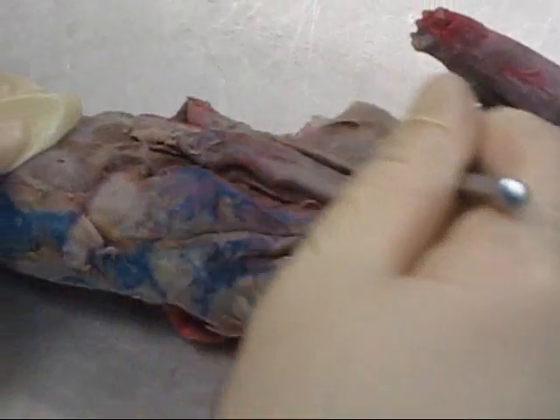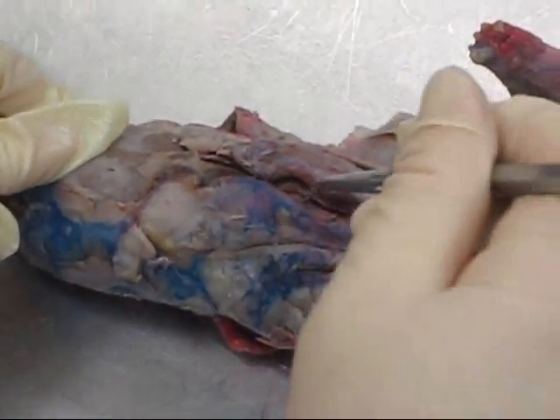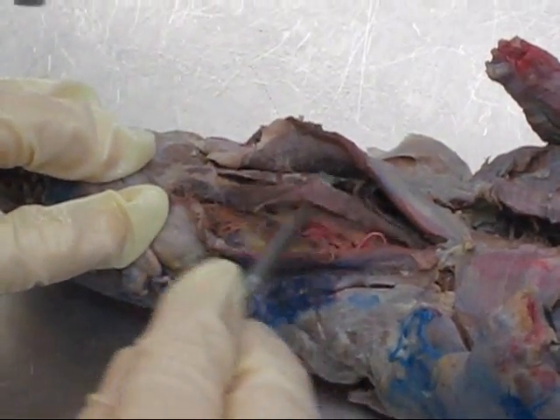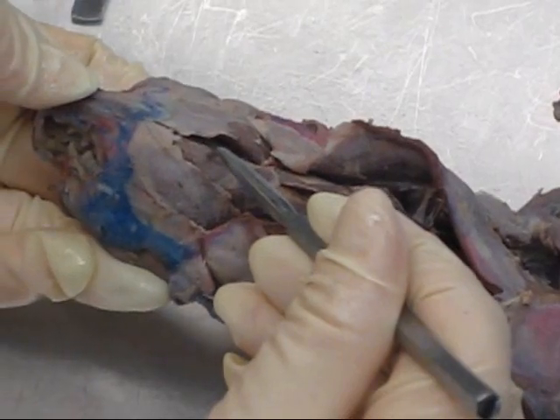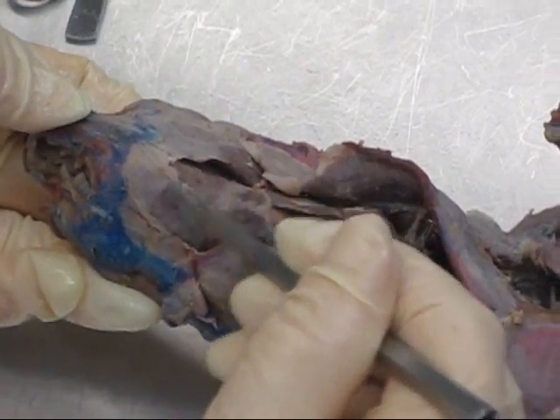Up here in the mink's neck, two muscles coming down like a V — these are the two sternomastoid muscles. Open them up. Inside here we have two parallel-running sternohyoid muscles. A little bit further up toward the head, in the middle here, this is mylohyoid. These two are digastric muscles.